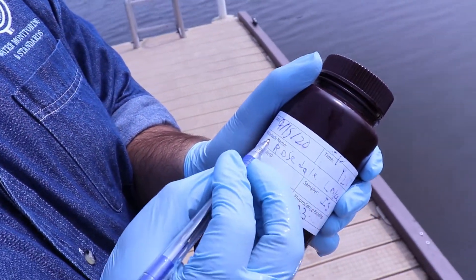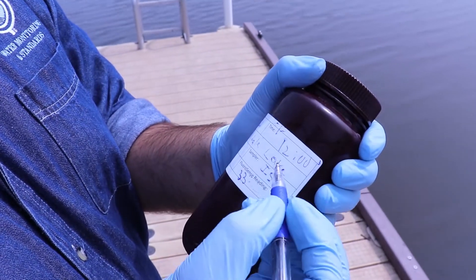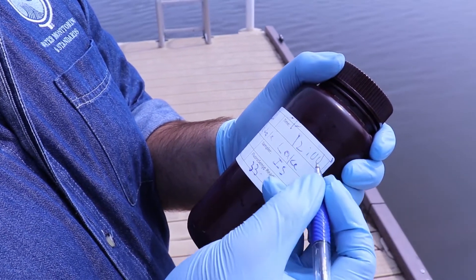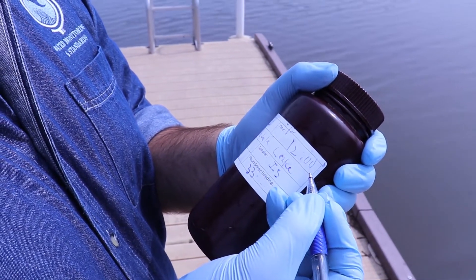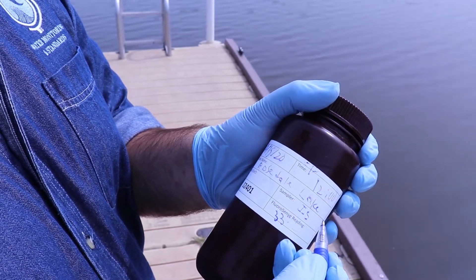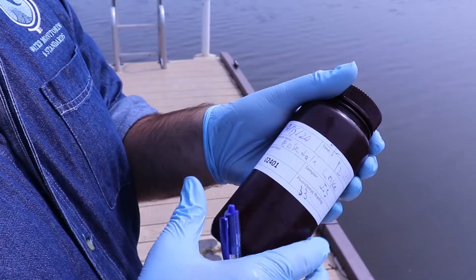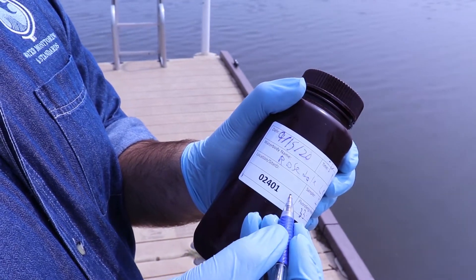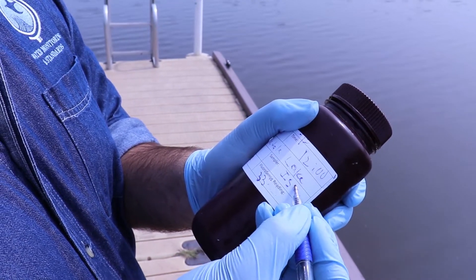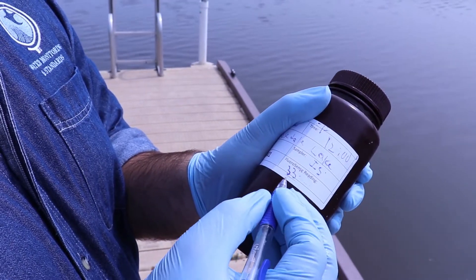Now fill out the label. Write down the date and time — note it uses 24-hour format, so for example if it's 1 PM you would write 13, not 1 PM. For the water body name, write down the full name of the lake — for example this is Rosedale Lake, so write Rosedale Lake, not just Rosedale. The location or site ID will be assigned to you. The sampler field is your organization and your initials. The fluorescence reading is the reading you took, as shown in part two of this training series.